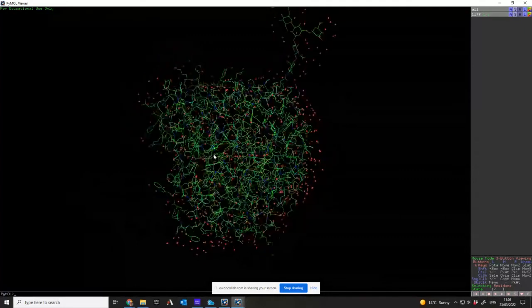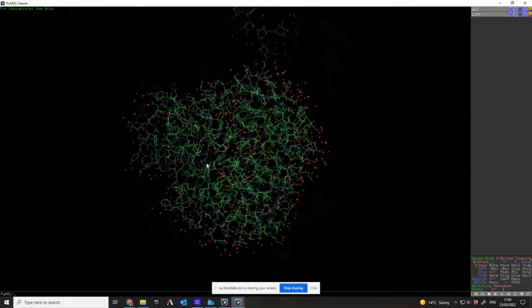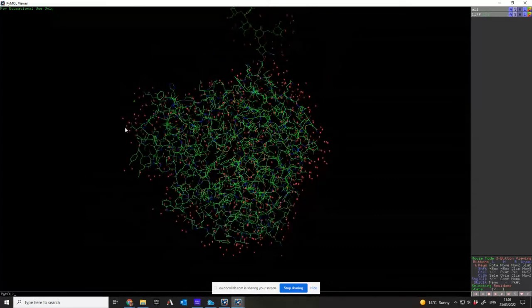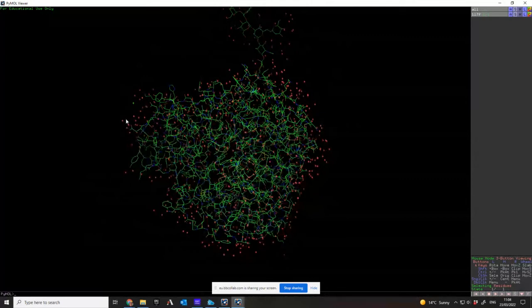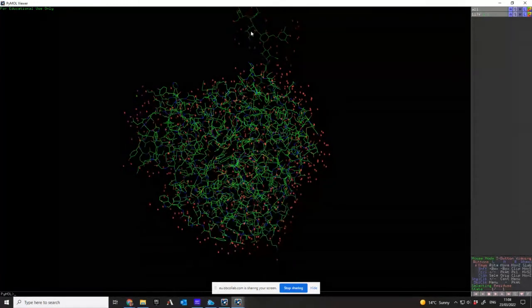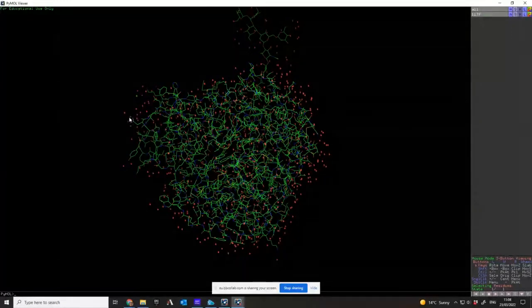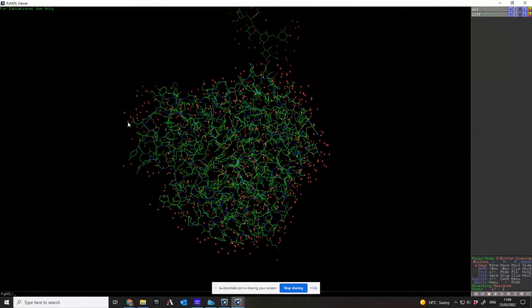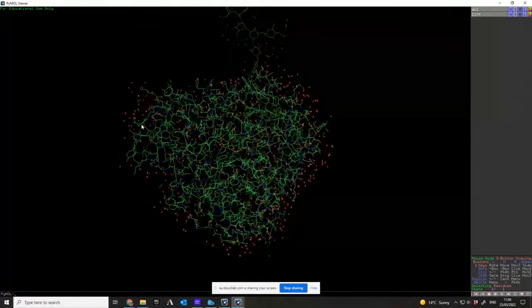And water is a very important part of protein structures because each of these waters is actually attached to the protein by hydrogen bonds. So when you get to the end of a chain, so here you've got some oxygens. So oxygens are coloured red, nitrogens are coloured blue, carbons are coloured green. So when you get some oxygens at the end, these hydrogen bond to water molecules. So this is an amino acid with an acidic group on the side, so it attaches itself to two waters that both attach to the different oxygens there.